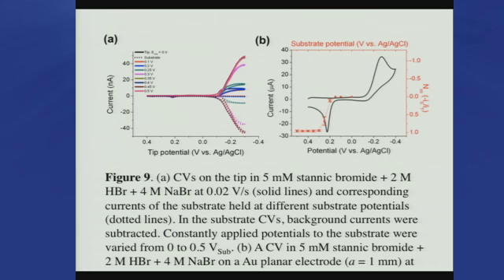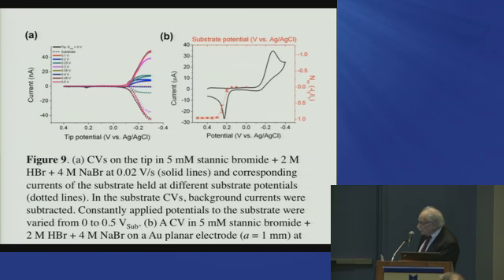However, if I put the potential at the foot of this reduction wave, now I'm not going to collect any tin 2. I'm not at a potential where I can collect tin 2, but if there is any intermediate formed that's oxidized in here, I'll find that. And so I compare, and those are the smaller guys over here. In other words, if I put the potential here, I can collect some of that.